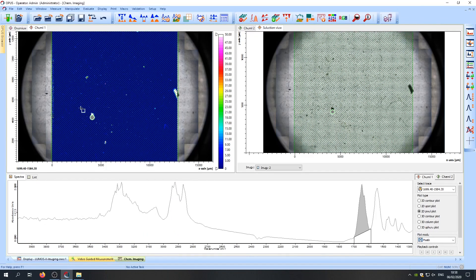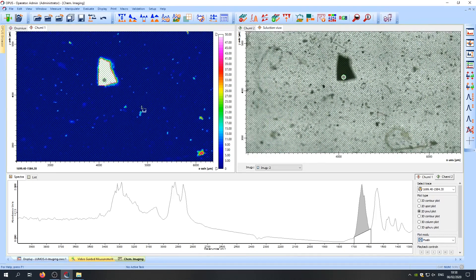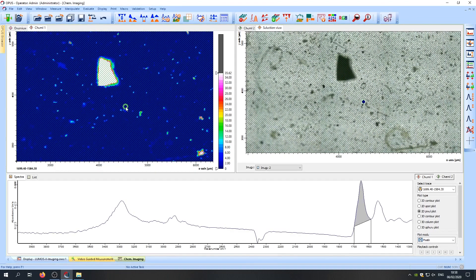Again, have a closer look at the area surrounding this big particle and we can see that there's also a lot of smaller particles around there. To highlight them even more, we are going to decrease the color scale a bit. And if we want to have a look at a spectrum, we can again just click on the particle to see what it looks like.